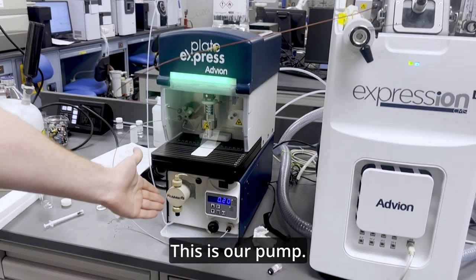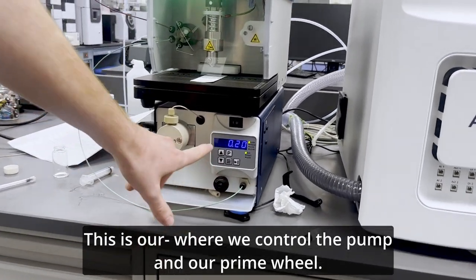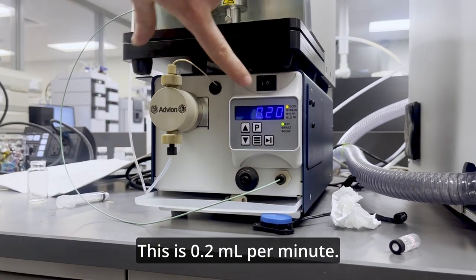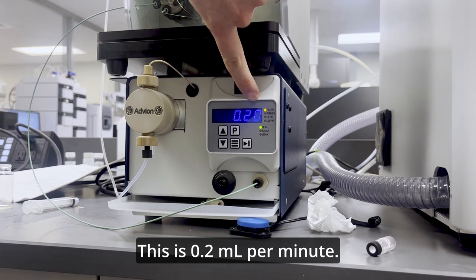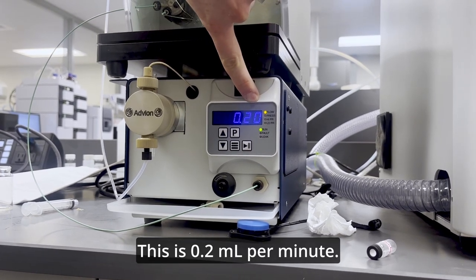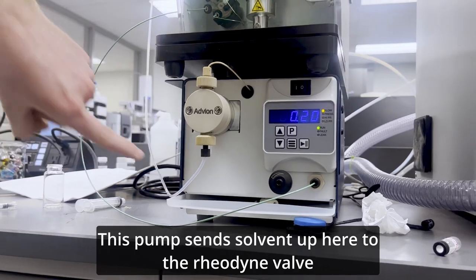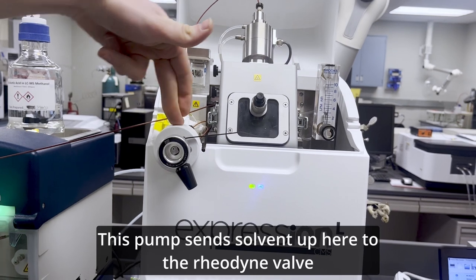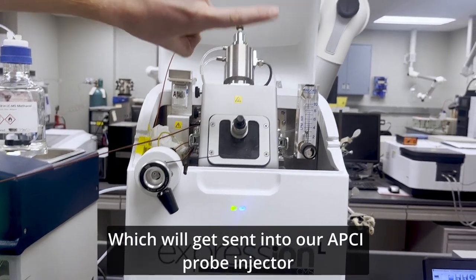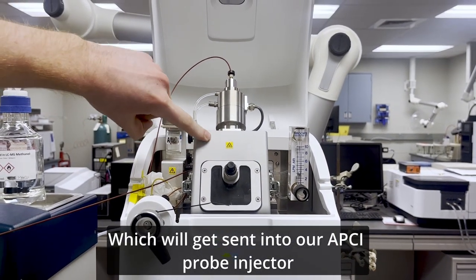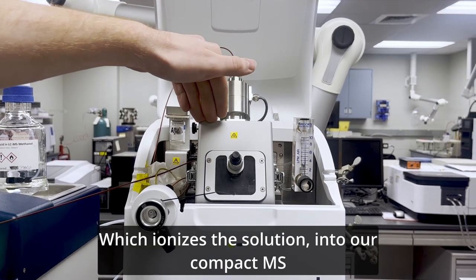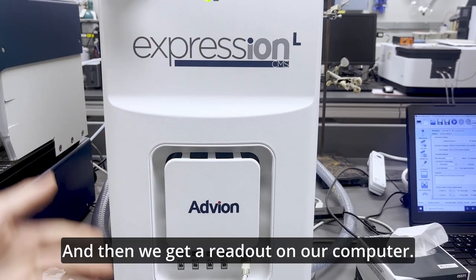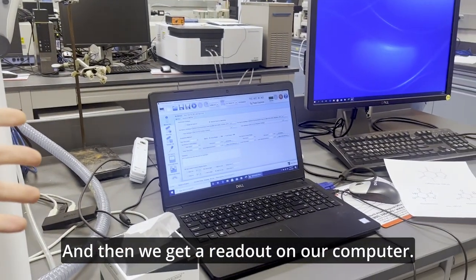This is our pump. This is where we control the pump and our prime wheel. This is 0.2 milliliters per minute. This pump sends solvent up here to the Reodyne valve, which will get sent into our APCI probe injector, which ionizes the solution into our compact MS, and then we get a readout on our computer.